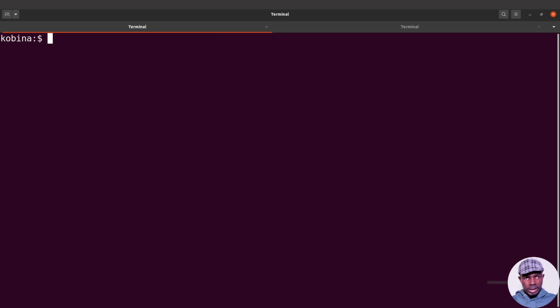Okay, so on the terminal, I'll also make sure I cd to the directory which has the file. So I'll say cd Nextflow. Alright, so I am currently in the directory which has the file. I'll do an ls, and I'll see it here. So just make sure that you have also cd'd into the directory which has your FASTA file. It's important. We just want to make sure things are streamlined. Just make sure you are in the same directory as where the FASTA file is. I'm making emphasis on this.